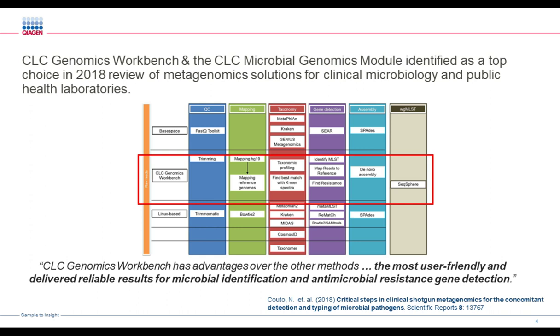The CLC Genomics Workbench and the associated CLC Microbial Genomics module, which is produced by QIAGEN, has been identified as the top choice as far as commercial software is concerned for metagenomic solutions of clinical microbiology and public health lab data.